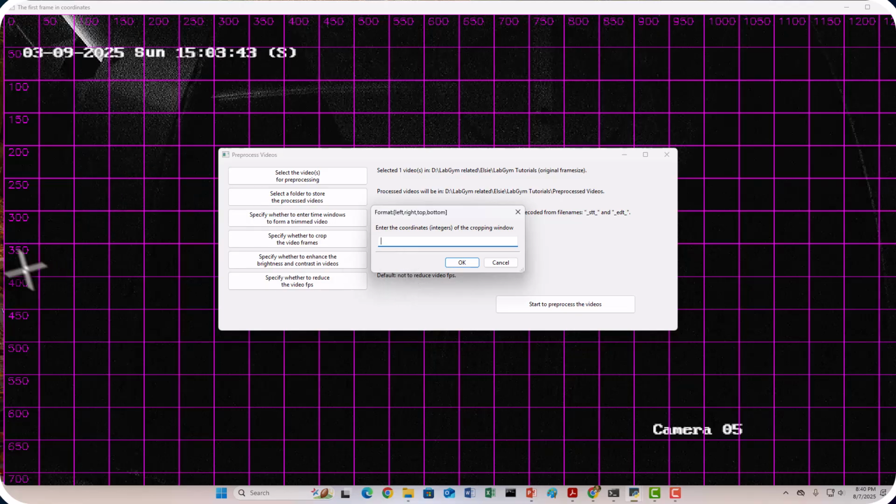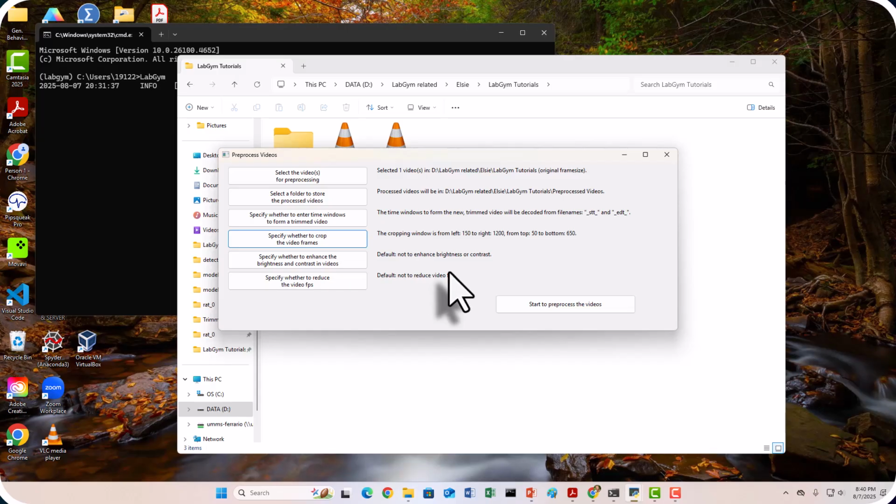So let's say I want my video to be cropped over on this side quite a bit. Let's say I want it to go all the way down to this 150 mark, so I'll do 150, comma, and then I will go all the way to the right. Let's say I want it to go to the 1200, so I'll say 1200, comma, and then we'll go to the top. Let's say I want the video to go right here along this line, so I'll do 50, and then along the bottom here, I'll do 650 along the bottom. So we'll select OK. And then it'll take us back to this screen.